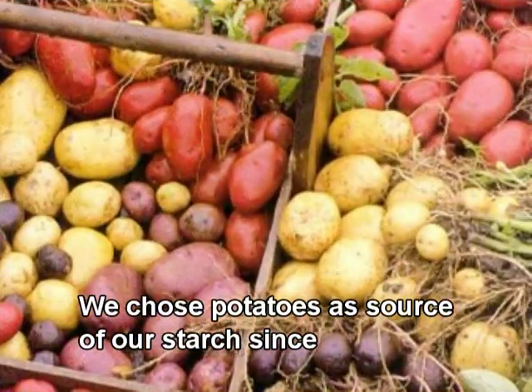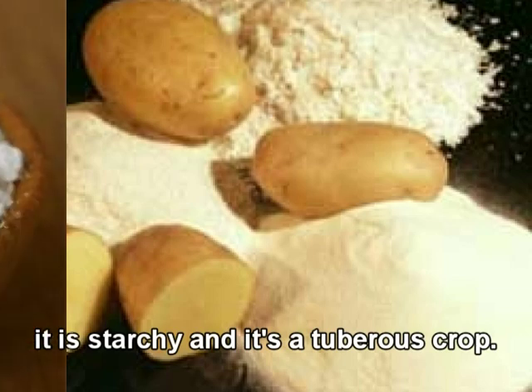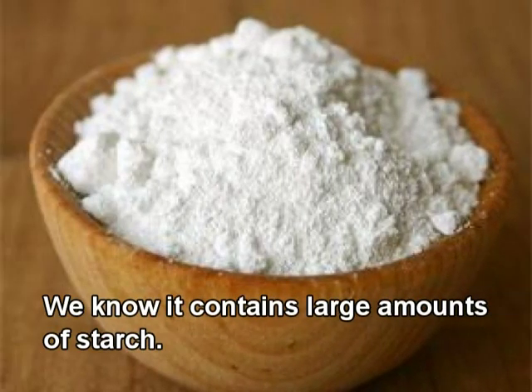We chose potatoes as the source of our starch since it is starchy and it's a tuberous crop. We know it contains large amounts of starch.